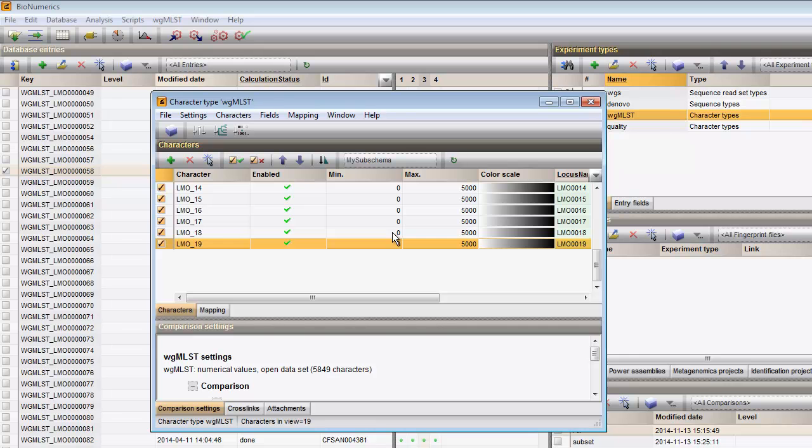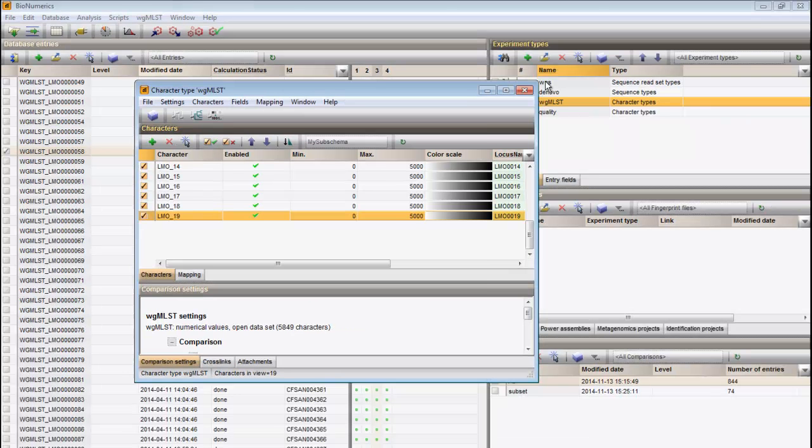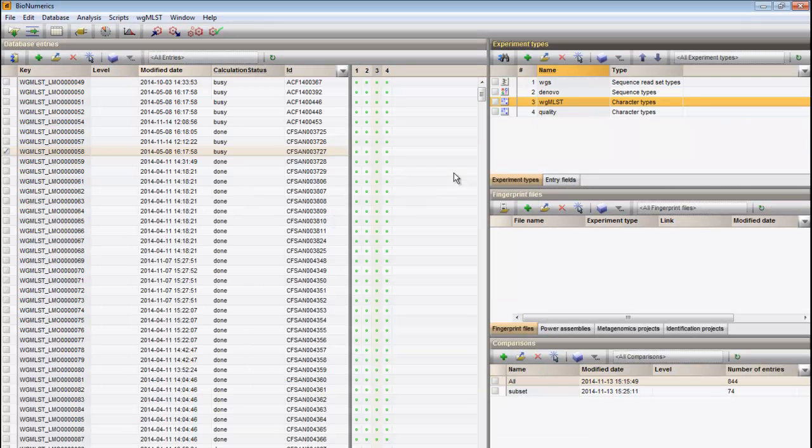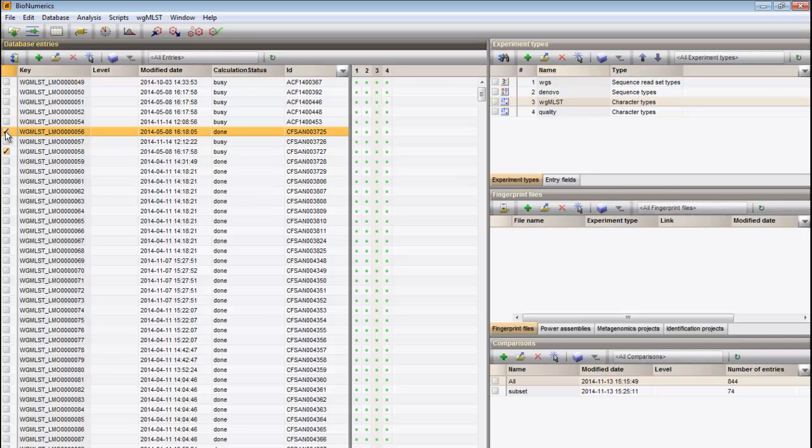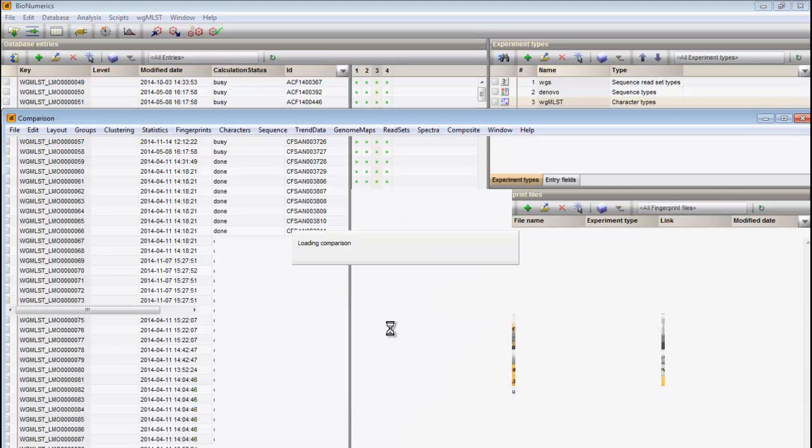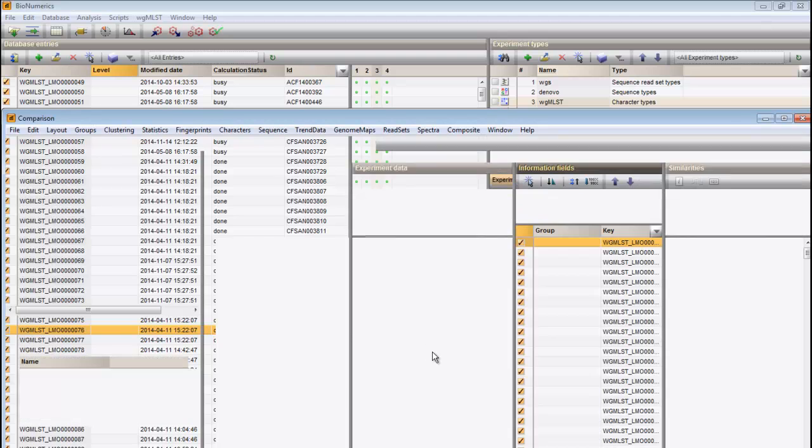Next, I will perform a sample analysis. I select a number of entries and I open a comparison window.